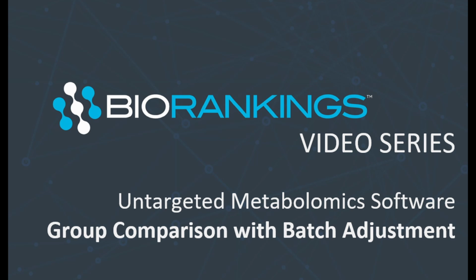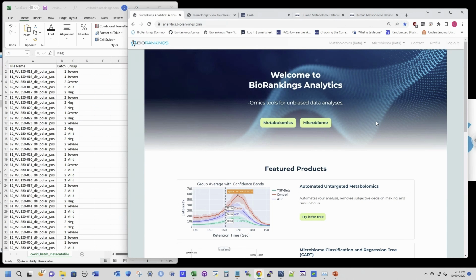Today I will be showing you how BioRankings analytics software can automatically adjust for the batch effect in your untargeted metabolomic data. To begin, I share with you two windows. On my right hand side is the BioRankings analytics homepage. I'm already logged in. However, for you to get here, just go to your browser and type in analytics.biorankings.com.